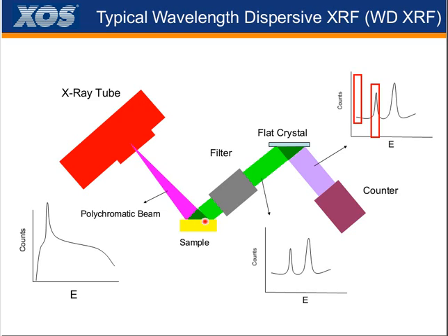But on the back end here, you can see where with large WDXRF, traditional WDXRF, they're using things like filters, crystals. They're using pieces on the back end to isolate certain wavelengths of energy and just separate out what they would like to see. But the problem here is that you're still using a scattered beam on the front end, and you're actually using a very high-powered source here too. So that X-ray tube can be up in the kilowatt region, anywhere from 1 to 4. I think even some of them maybe as high as 10. But they're very high-powered X-ray tubes.